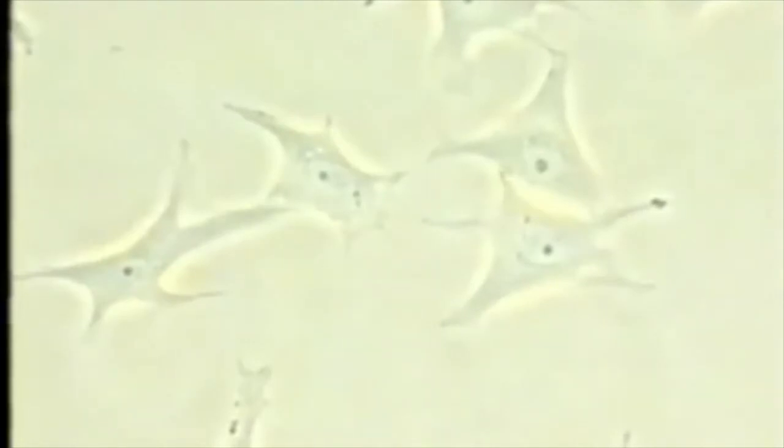In the presence of the same 1 milligram per milliliter concentration of PB100, normal astrocytes undergo no morphological change. A yellow cloud of anti-cancer agent simply underlines external cell contours, and it does not enter the cell. Under ultraviolet radiation, astrocyte contents are in no way fluorescent.